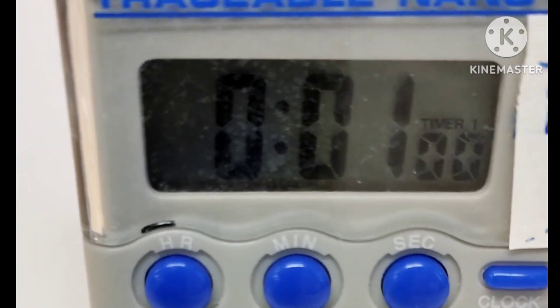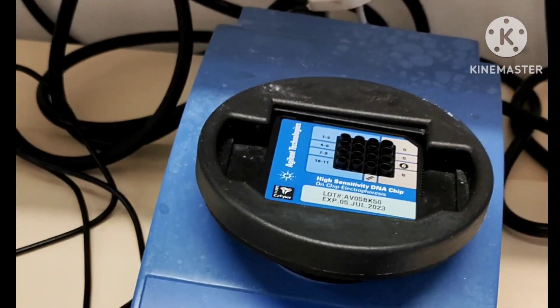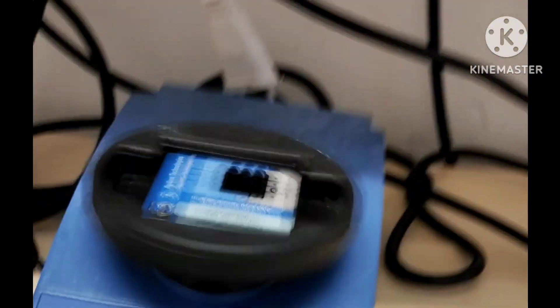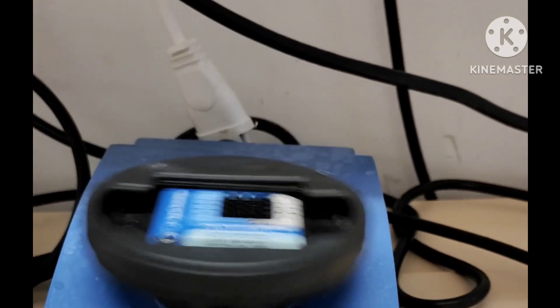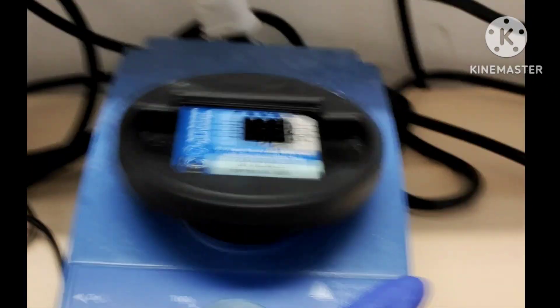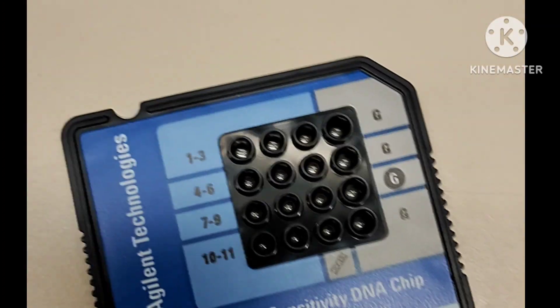Now set the timer to one minute, then place the chip on the vortex mixer and turn on the vortex for one minute.